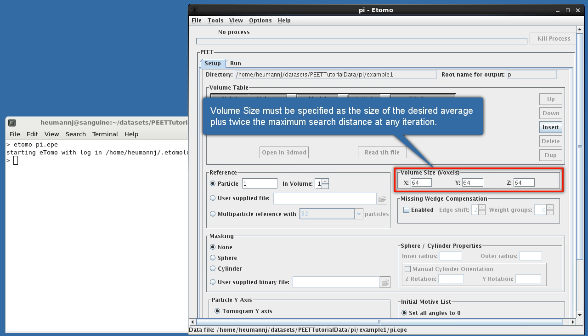was sufficient to contain the region of interest, and if the maximum search distance was 6 voxels, I'd specify a volume size of 60 rather than 48.